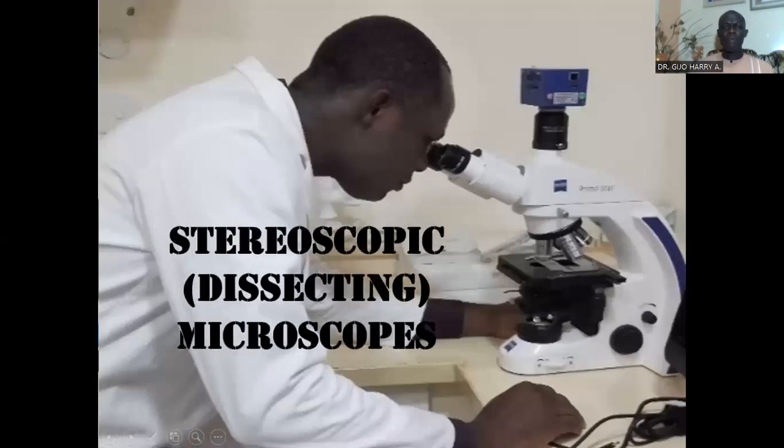The next type of microscope we want to discuss is the stereoscopic or dissecting microscope. The stereoscopic microscope is also called a stereo microscope for short, and it's also referred to as the dissecting microscope.